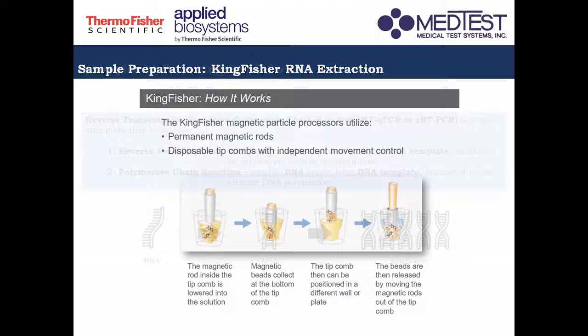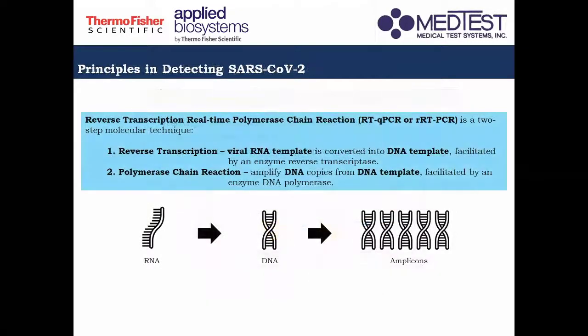So we proceed now with the next step, which is the detection step. So gaya ng sinabi ko kanina, as an introductory, the method by which we detect the SARS-CoV-2 is the use of real-time polymerase chain reaction.